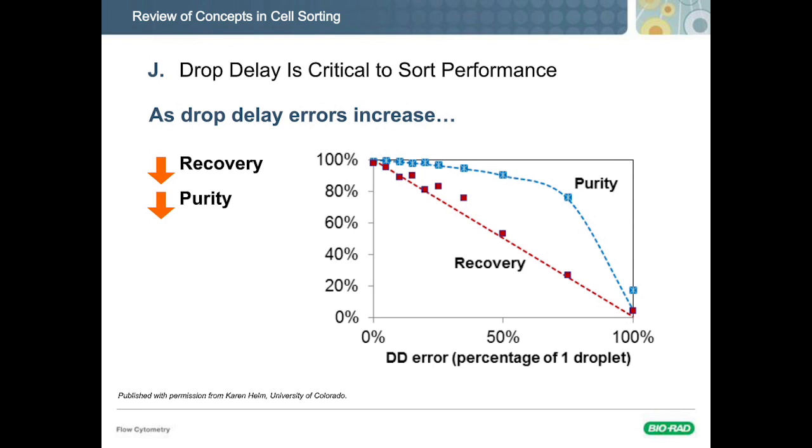A good way to think about that is if you're doing 1,000 cells per second, but at 40 kilohertz, or 40,000 droplets per second, on average there's 40 drops per particle coming through. So even if you missed it, and you sorted drop 1019 and it really ended up in drop 1020, there were still no other contaminants that ended up in the drop you did sort. So what you'll see is your recovery was lower, and we define all of these things later.